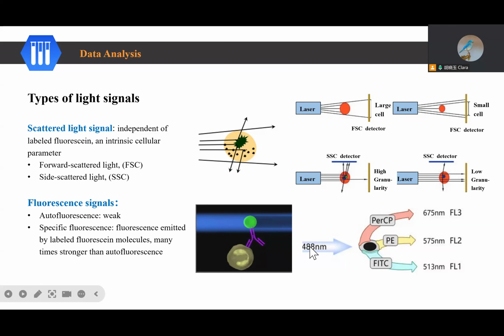And then we have the fluorescence channels like this. Here, this is the blue laser. Blue laser has its corresponding channels like this. Using channel-specific reagents, we can stain the cells and then detect the corresponding reagents. We can get the information of the marker.